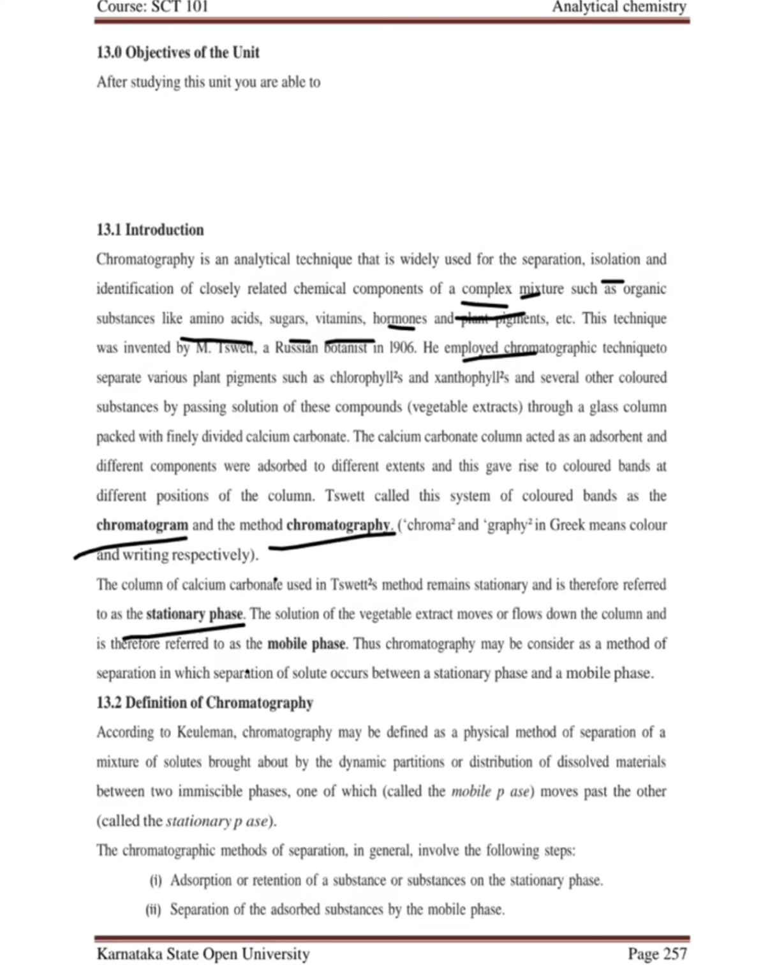That is known as the mobile phase, which moves from the top, flowing through the adsorbent, and the components are eluted at different time intervals. So it is a physical method for separation of a mixture of solutes. Solutes are nothing but the given mixture.